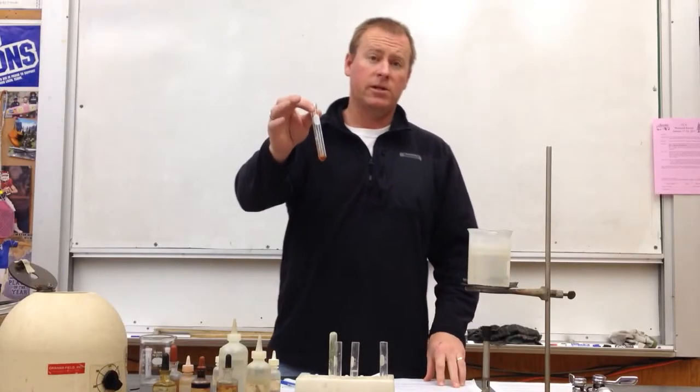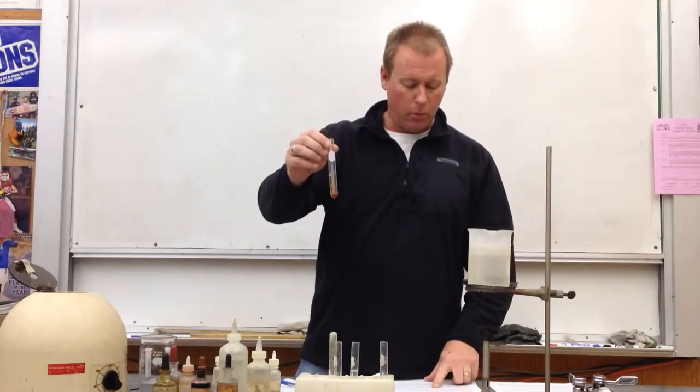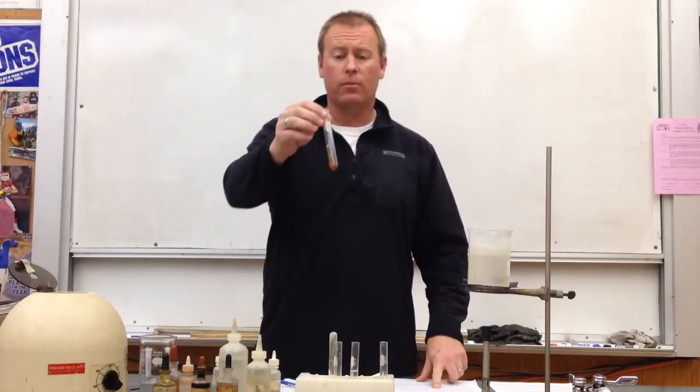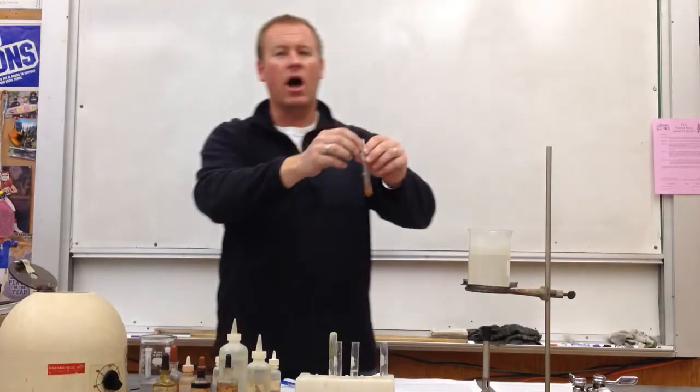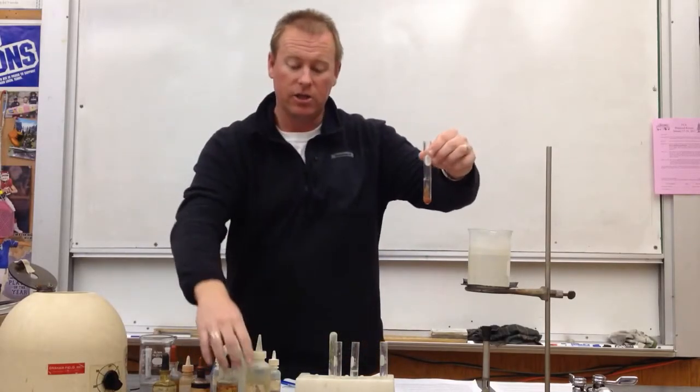Here we are for step seven. We're going to take that precipitate that we just got in procedure six, and we're going to add HCl dropwise. We're going to dissolve that precipitate. Since there's not a lot of this rust-colored precipitate, it's probably not going to take a lot of HCl.